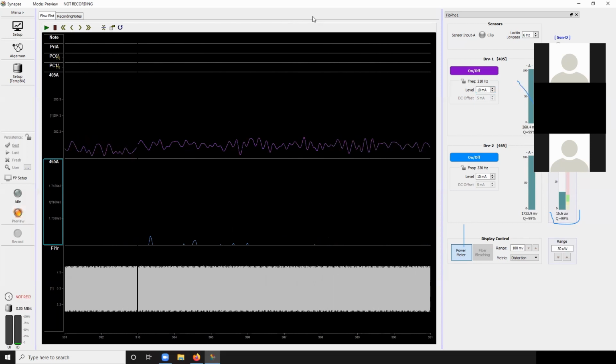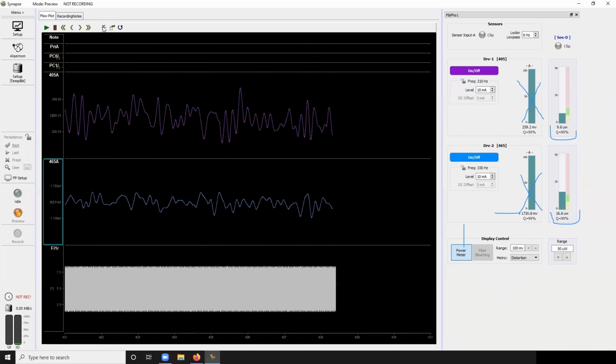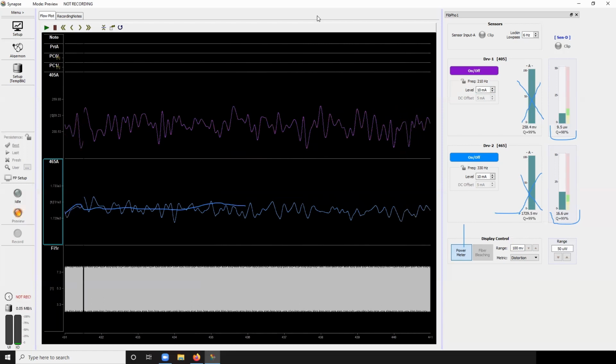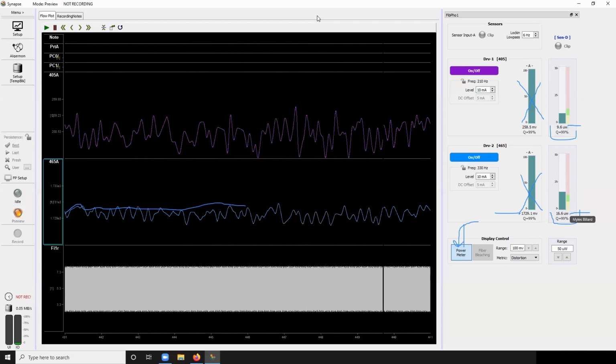So you want to just ignore the quality factor and the values coming out here. We'll talk about these later when we're actually doing fluorescent testing. One thing to note here is that these values that you see here, this 1730 and stuff like that, correspond to the amplitudes that you're seeing over here. And then the values over here in the PM1, again, I'd click this power meter button here, toggle that on and off, only available in preview mode. The values you care about right now are these power measurements in microwatts right over here.